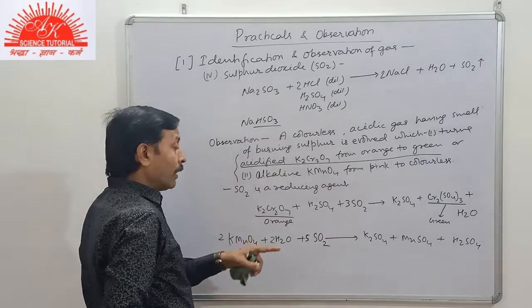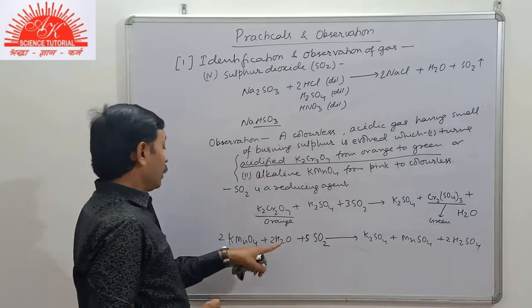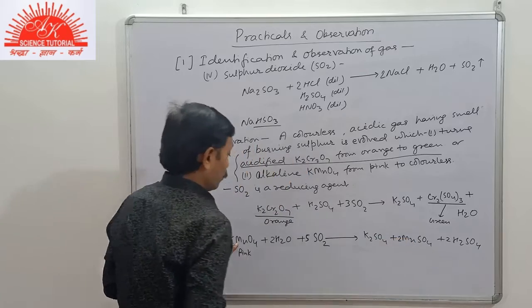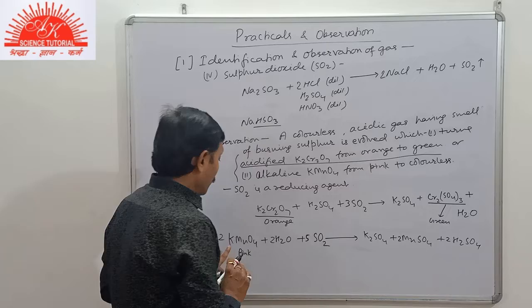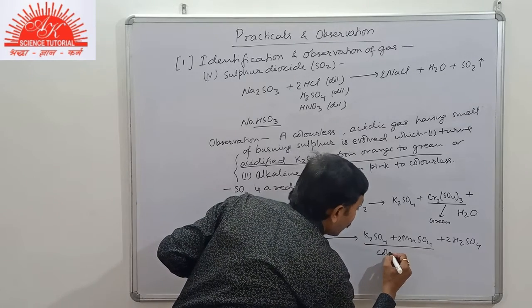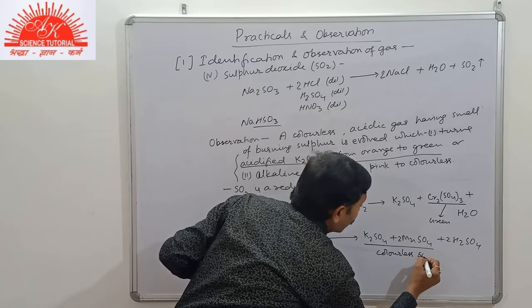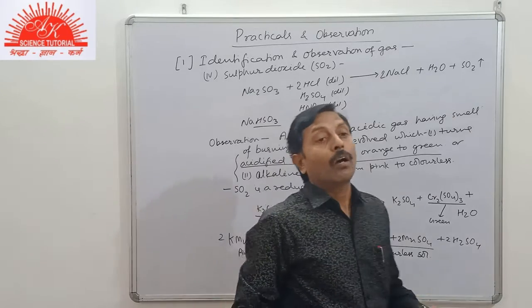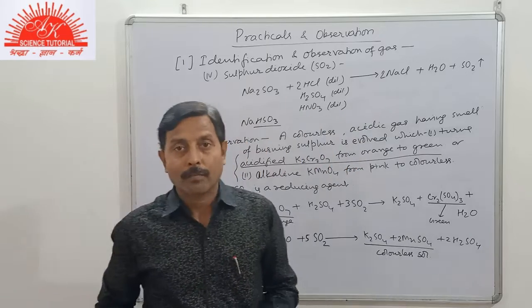So this time KMnO4 was pink in color and now this becomes colorless solution. So these two were the reactions or the tests for sulfur dioxide gas.